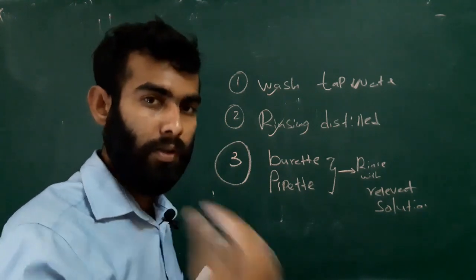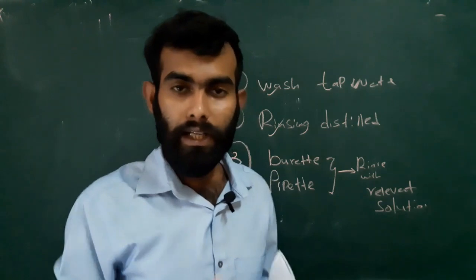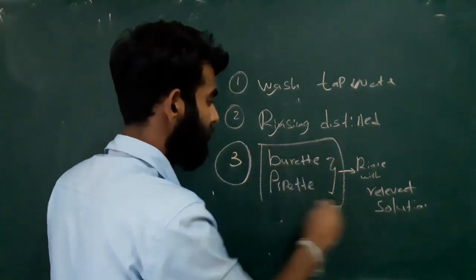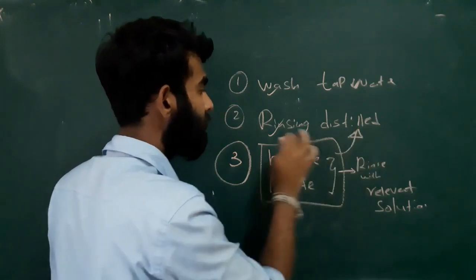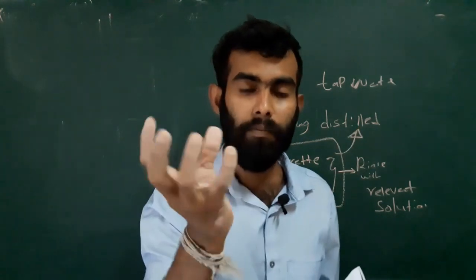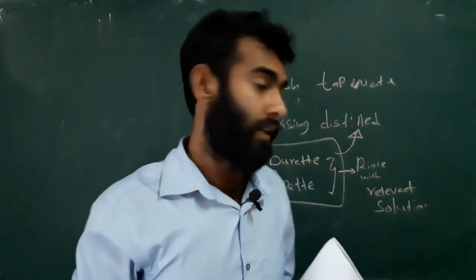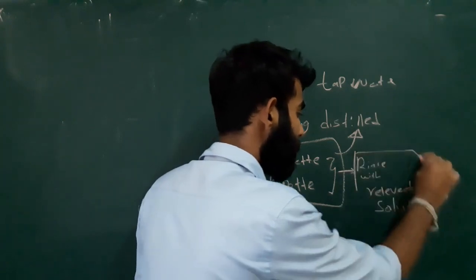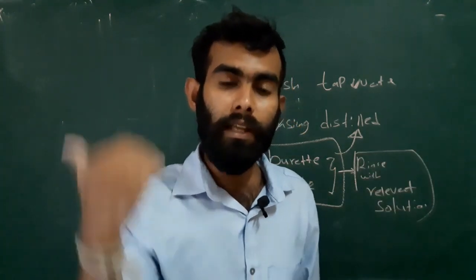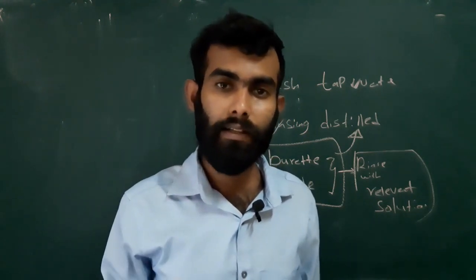Because if we are not rinsing, there may be an error. Before measuring, we rinse this glassware with distilled water. So if there are distilled water particles inside the glassware, the concentration of the solution we are going to measure will decrease because of the dilution effect.